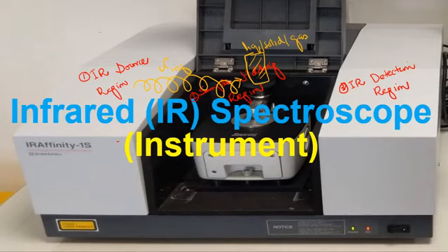The sample used in the infrared spectroscope is an organic or inorganic chemical, so it has specific bonding.